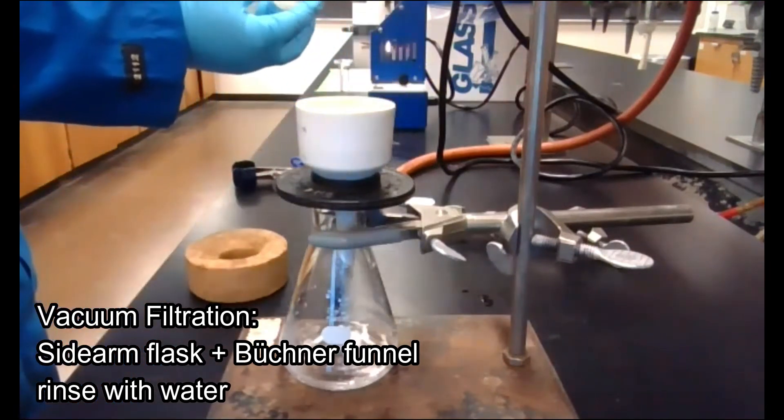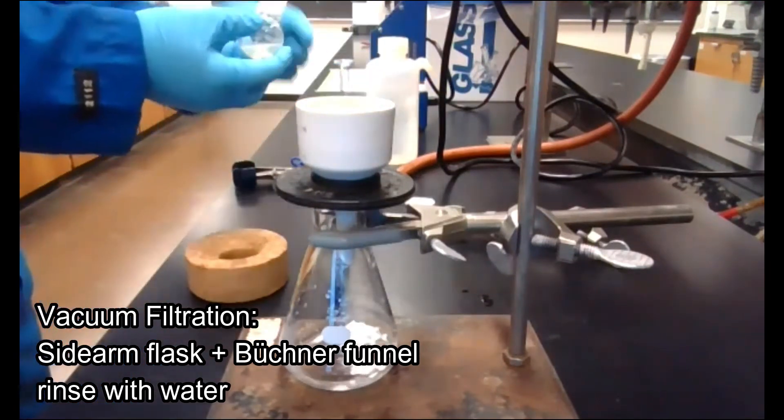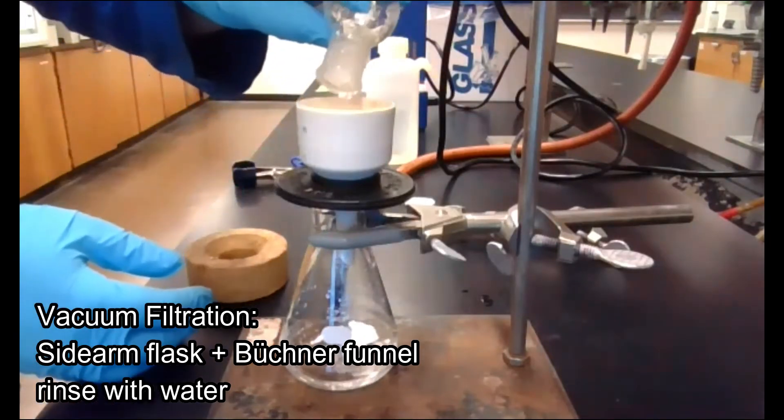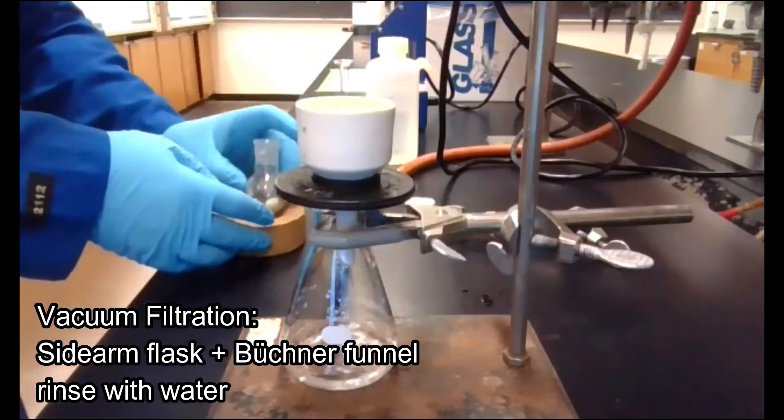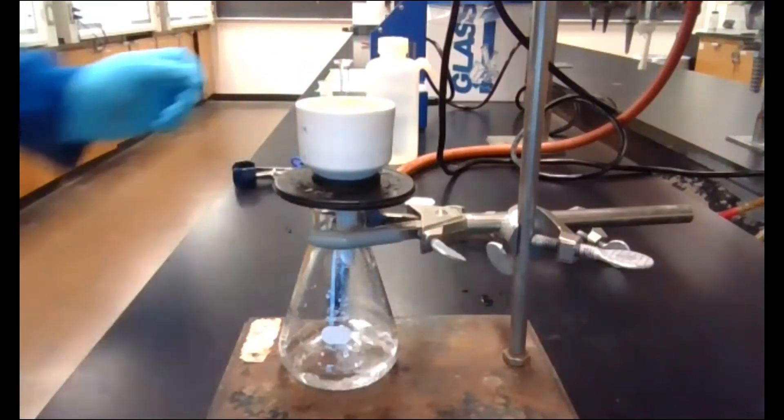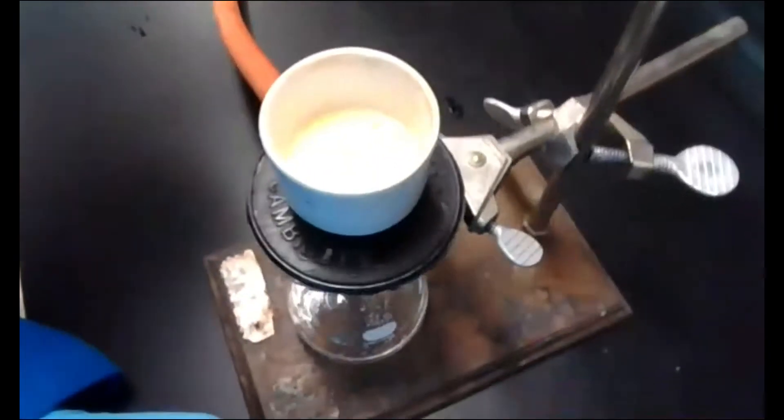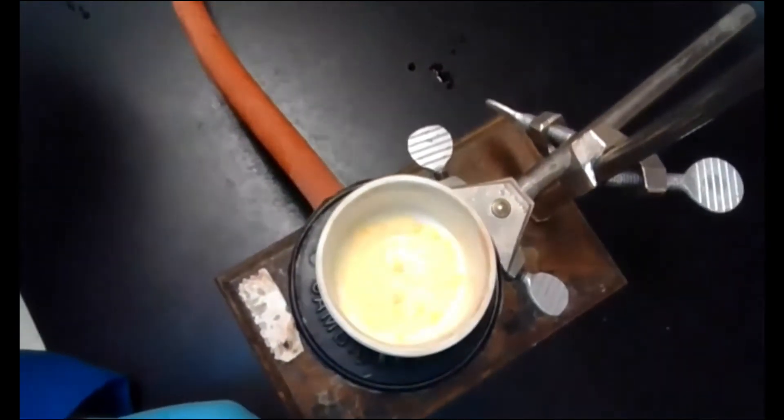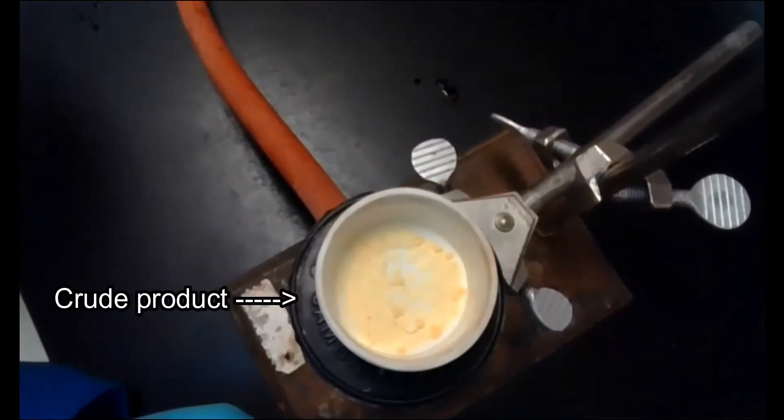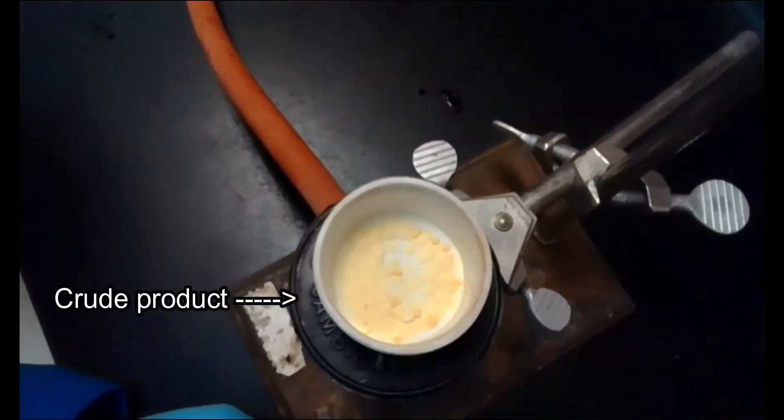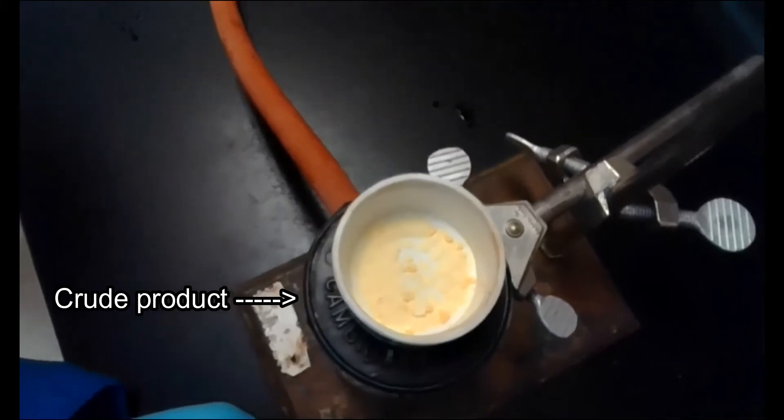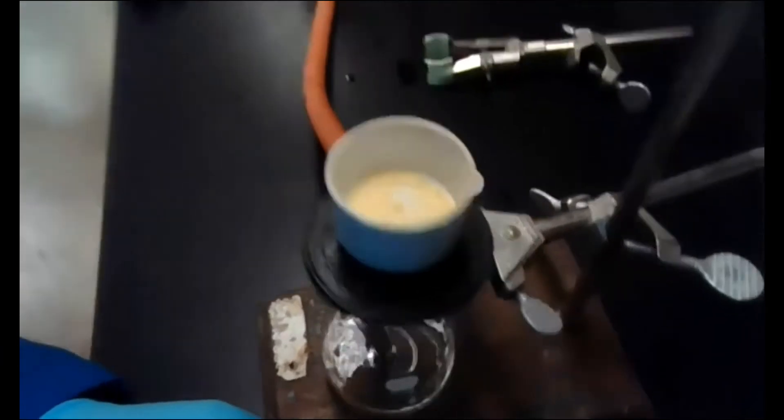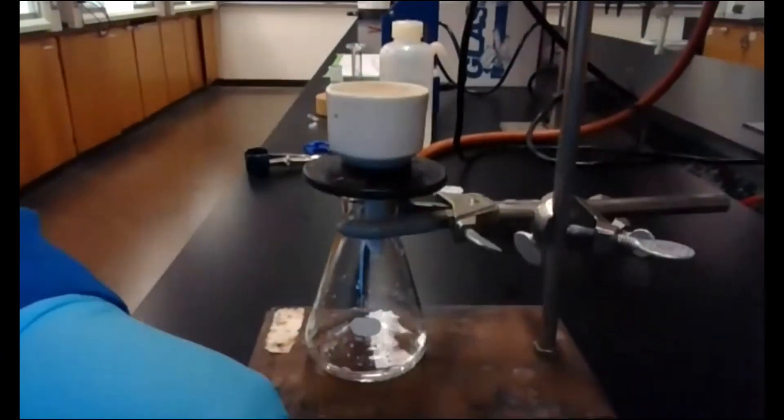I'll do another two mils or so, and we can see our solid in there is kind of yellow. We're going to go ahead and let this air dry for a couple minutes, and we'll get a crude melting point, and then we will recrystallize it. I'll be back when we're ready for that.